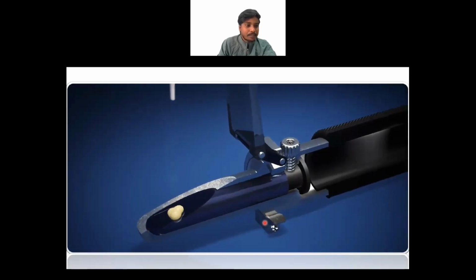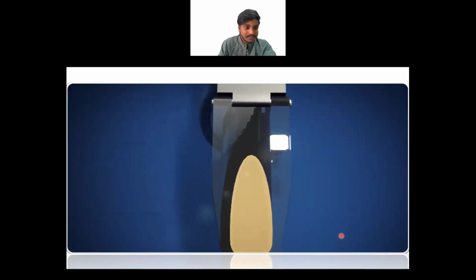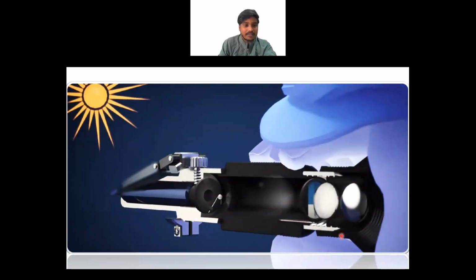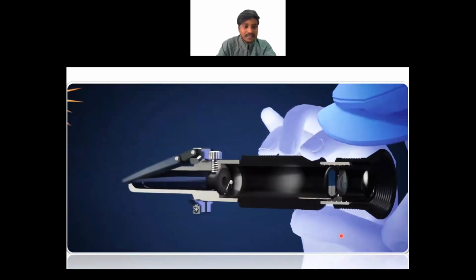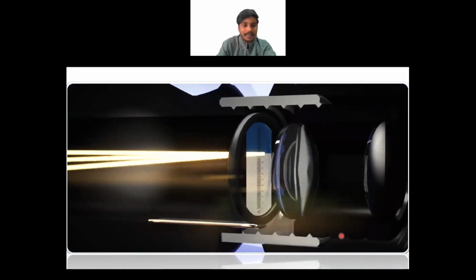After the liquid has been dripped onto the prism, the cover is closed, which distributes the liquid evenly on the prism. It is important that the liquid is distributed over the entire prism surface because measurement errors can occur due to uneven distribution. The instrument is held against the light. The observer looks through the eyepiece. By turning the eyepiece, the focus setting can be perfectly adjusted to the respective eye. The sun's rays are guided through the prism onto the scale depending on the refraction. A blue area appears with a clear dividing line with a bright area below.